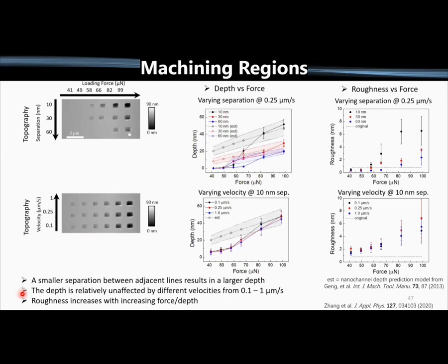And so if you want to do a tomographic type approach, you probably really want to do it a little bit slowly. You want to, in essence, operate in a polishing regime where you're just removing a little bit of material each time, which of course would be more time consuming, but then the surface would be much nicer for doing a PFM study.